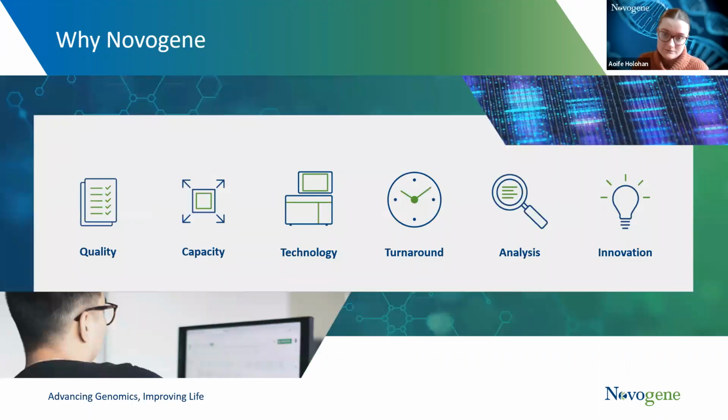Many other companies offer these services too, so why Novogene? There are a lot of good reasons why you should trust Novogene with your project. As I mentioned, we've had a really exciting development recently in the installation of the Novogene Falcon 2. This has now been deployed across our Chinese, US, and Cambridge labs, standardizing our global service. This new technology was developed in-house by Novogene and has already massively increased the capacity of the Cambridge Sequencing Centre. And it will also increase the quality of the data that we can produce because it is entirely automated and will remove the possibilities of any human error.